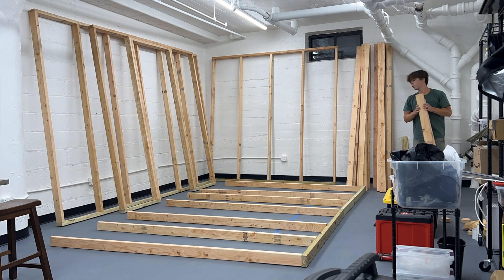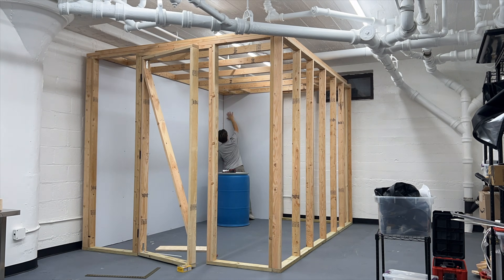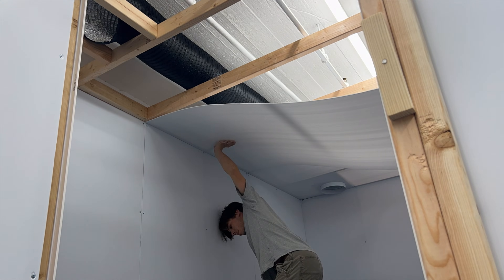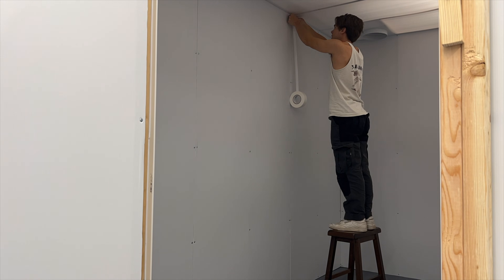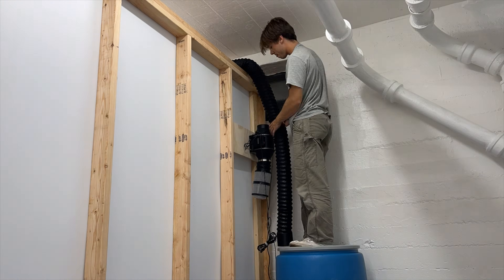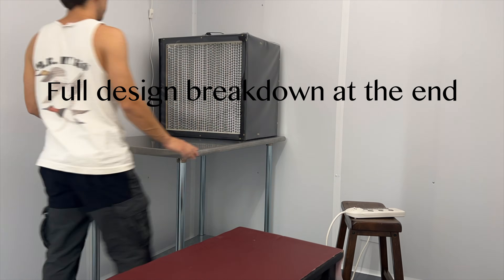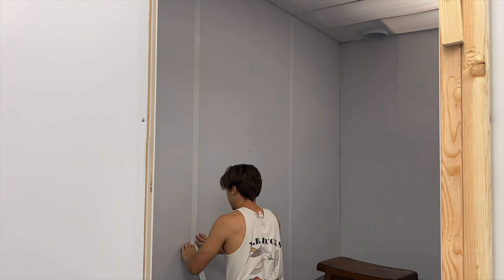The laboratory is the heart of a mushroom cultivation operation, acting as a nursery for the mycelium that we as mycologists propagate in order to grow mushrooms. Creating a clean work environment is crucial, because any contamination in our growing media can encumber or terminate the development of our precious mycelium. For this purpose, I chose to build a sealed, easy-to-clean room with filtered ventilation and a HEPA flow workbench inside my warehouse, ensuring I'll be able to grow healthy, contaminant-free mycelium that will produce high-quality gourmet mushrooms.